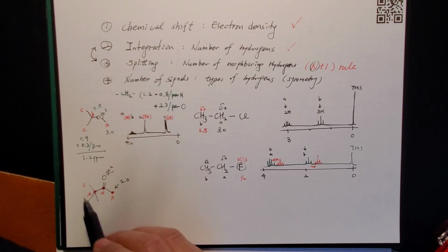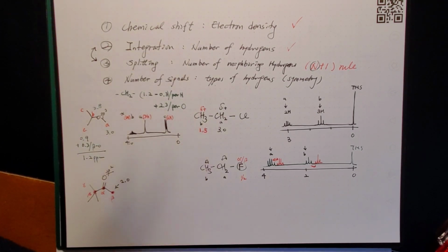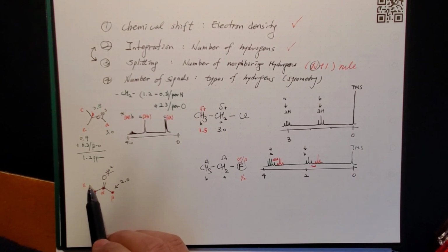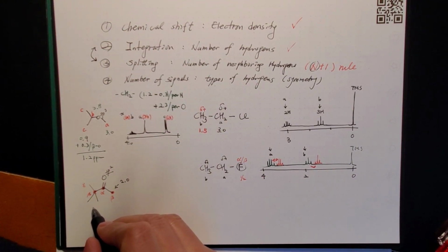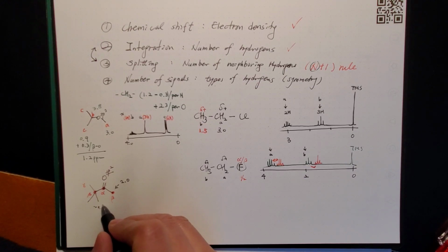And this one here, it's like a CH3. So remember, CH2 is about 1.2. If you have one more hydrogen, it should be more shielded. So it should be about 0.9. Less than 1 is enough. Okay, so you can say, roughly speaking, around 0.9 ppm.